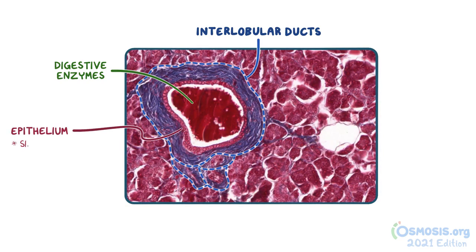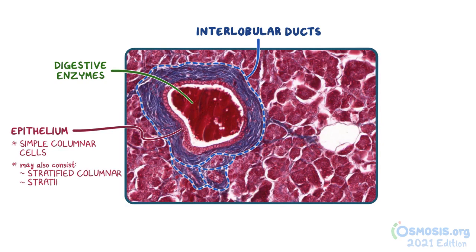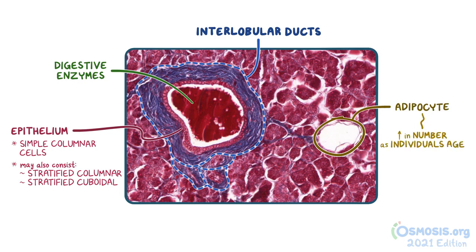The epithelium consists of simple columnar cells in this image, but some ducts might also consist of stratified columnar or stratified cuboidal epithelium instead. To the right of the interlobular ducts is the adipocyte. The adipocytes actually increase in number within the pancreas as individuals age, which is a normal finding caused by pancreatic atrophy over time.